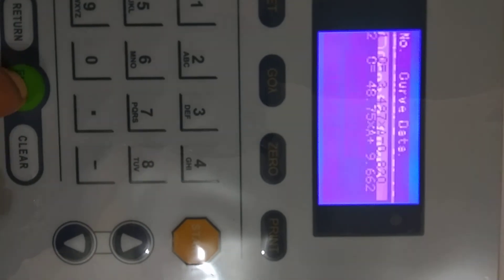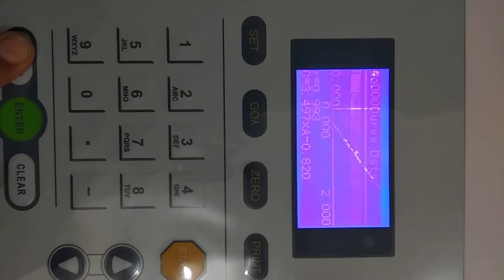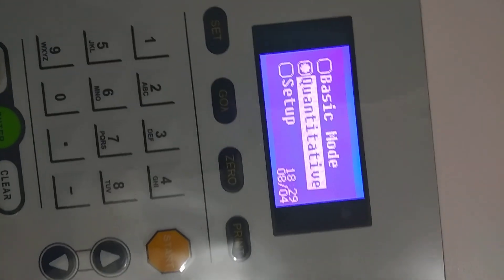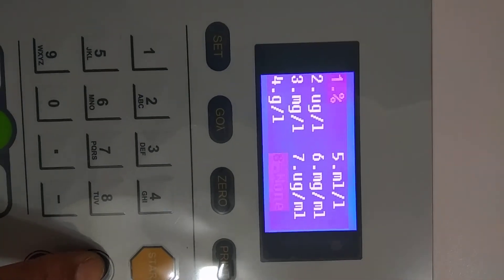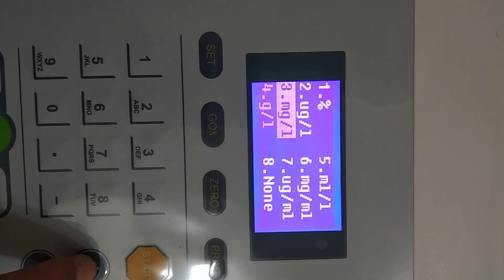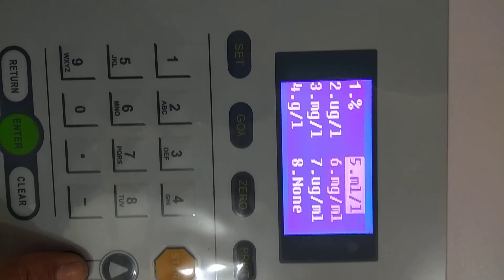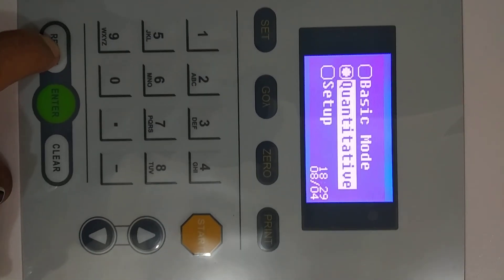Press Return, and if you want to load a previously saved graph, go to Load Curve and press Enter — your previously plotted graph will be shown. In the Unit option, you can change the concentration unit of your sample by pressing the up and down keys and pressing Enter. Then go to Instrument Mode, press Enter and Return, and go back to your main menu.